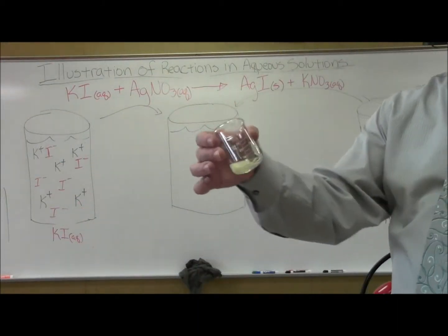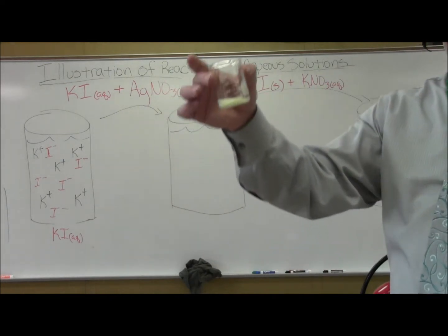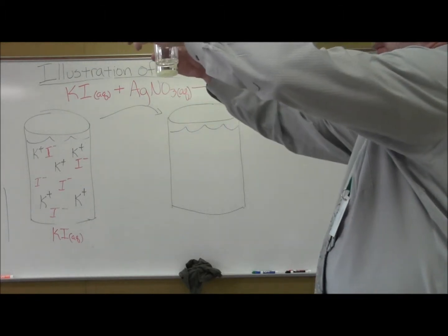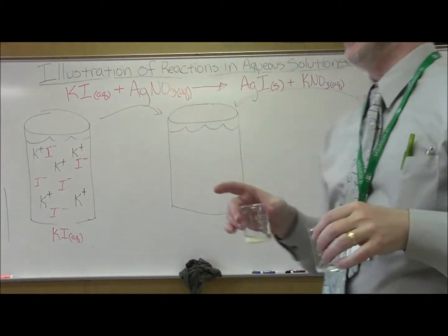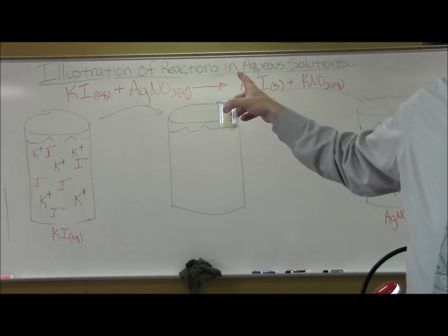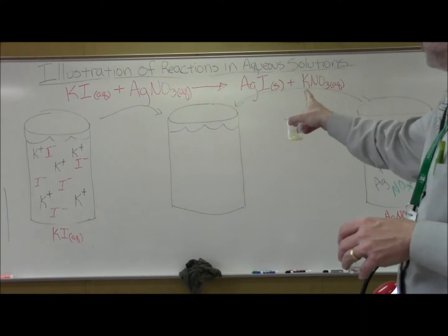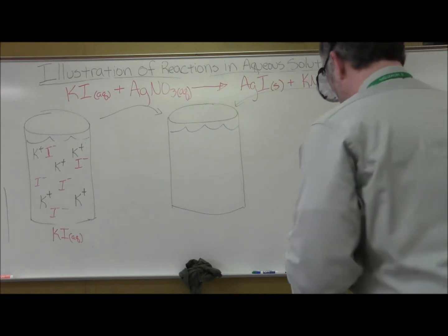All right, so for those of you viewing at home, I don't know if you can see the precipitate stuck to the bottom and it changed to a yellow color. No reaction. Reaction. Now, let's show this up here. The big part isn't about showing what's going on in that middle beaker. The net ionic part to me is going to be the most helpful for you.